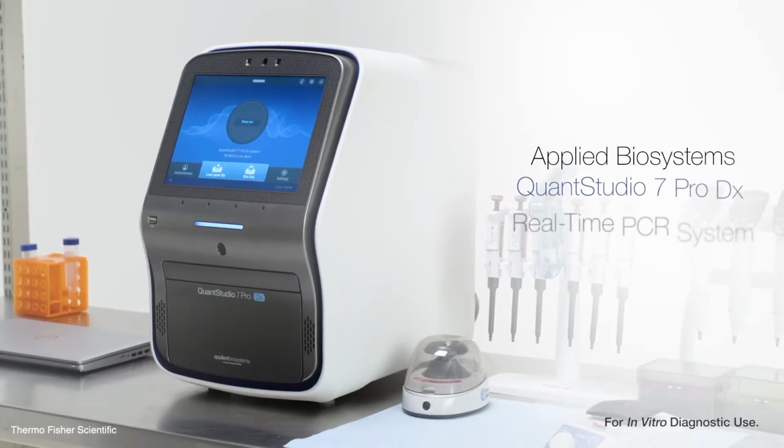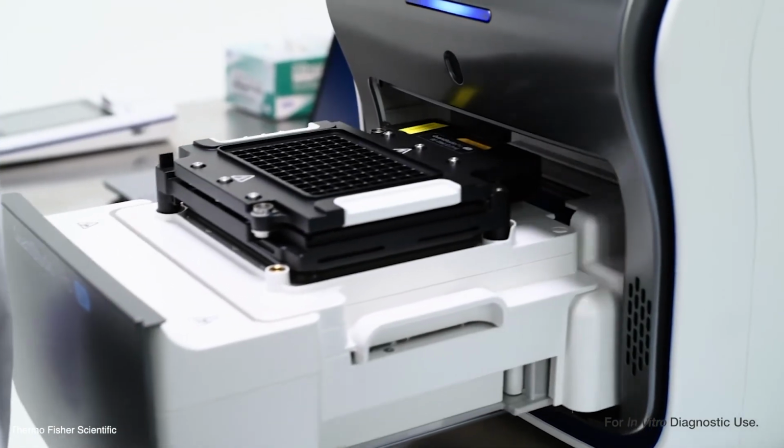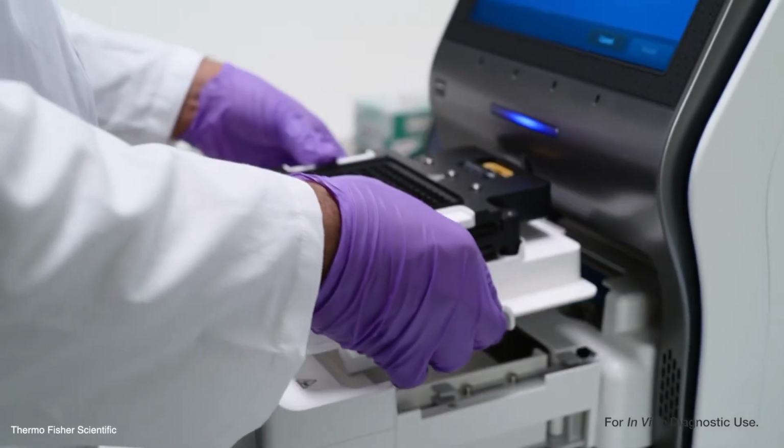For one, typical thermal cyclers require a lot of energy as they have to quickly heat up and cool down to perform the PCR reaction, usually requiring at least 2 or 3 different types of working temperatures for annealing and denaturation. Also, thermal cyclers are fairly sophisticated equipment and such quality doesn't come cheap, especially in real-time cyclers. Also, these need some amount of regular maintenance.